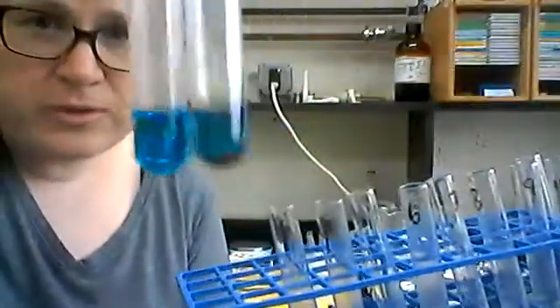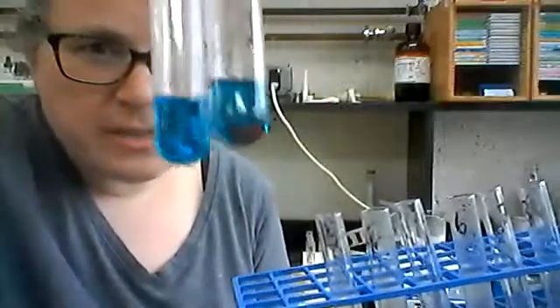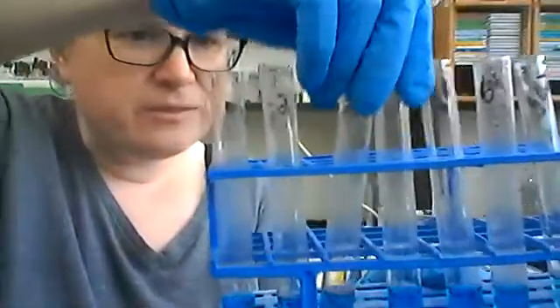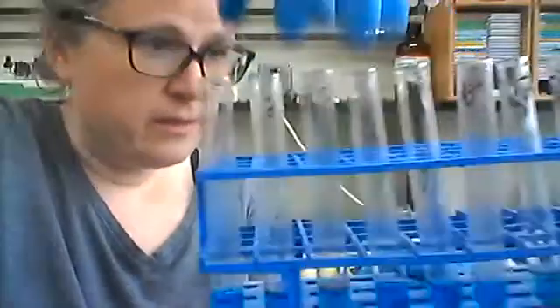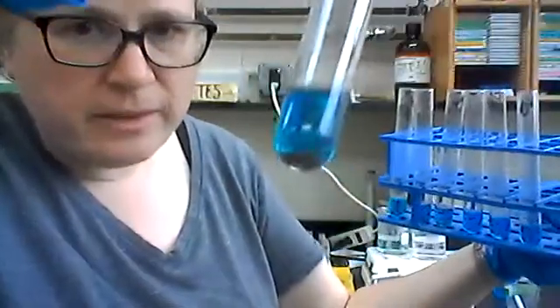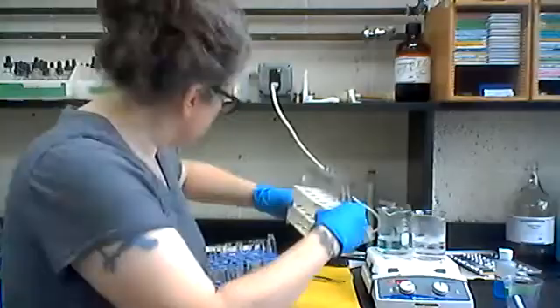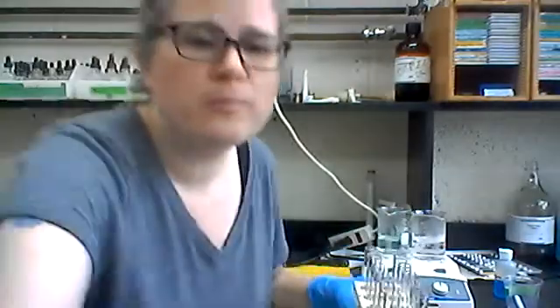I will also show you the results from heating the Barfoed's reagent. And again, I'll take some photos. But you can see some of them have this reddish precipitate in the bottom. It's not the easiest thing to see in the photo, so I wanted to point it out here. You can see some of them have more than others. Number seven has quite a bit in the bottom. One of our unknowns has a little bit in the bottom also. So that's after going through the heating process. I'll stick these with the Lugol's iodine in the hot water bath and show you those when they're done.